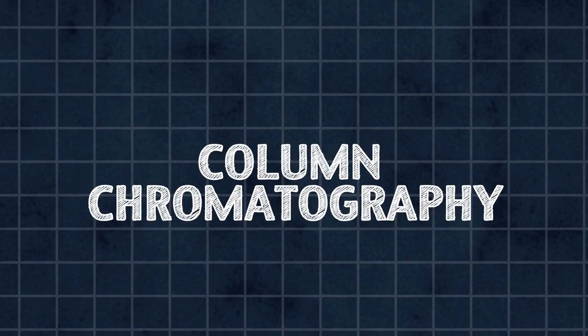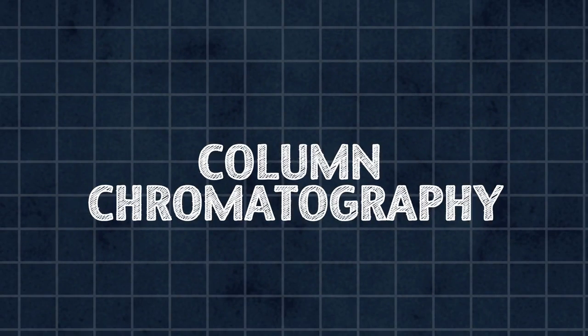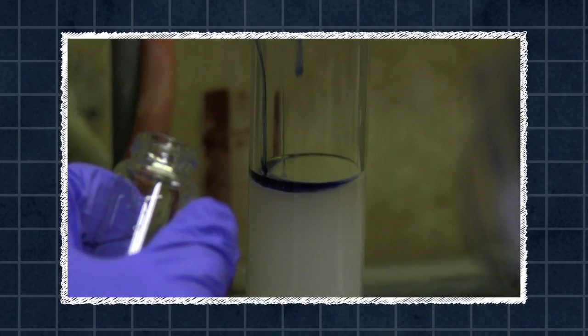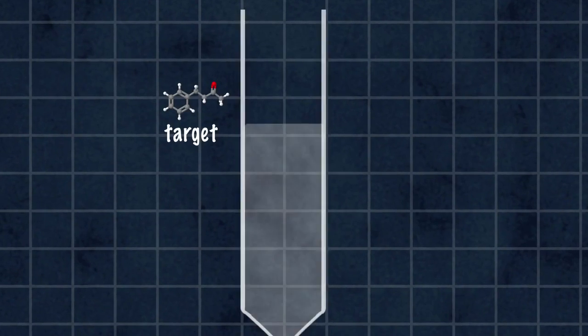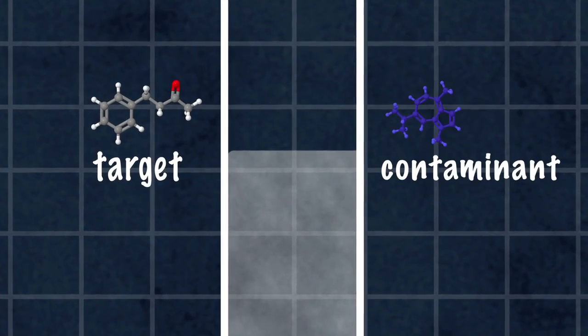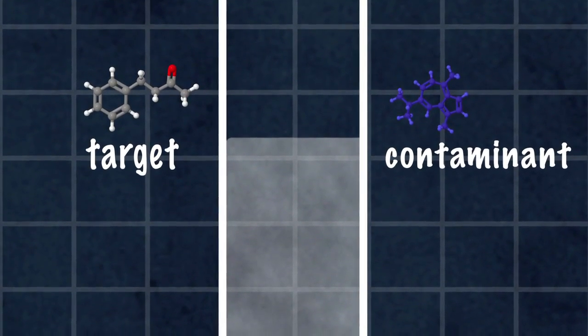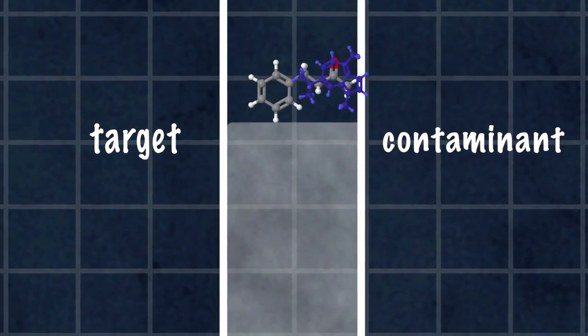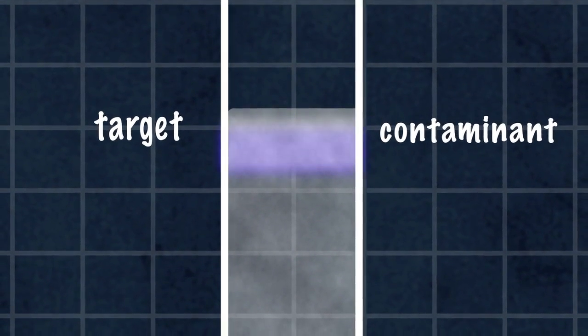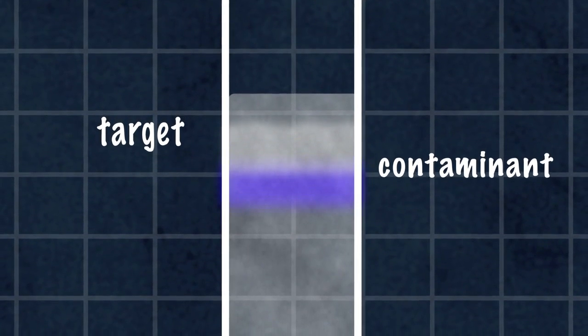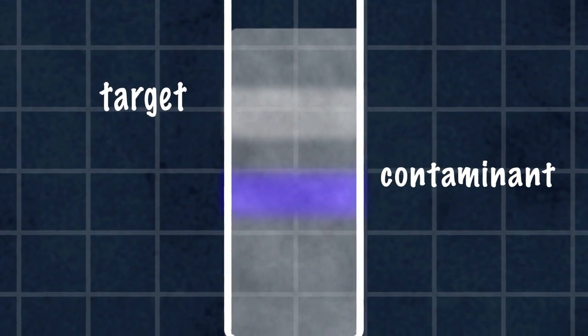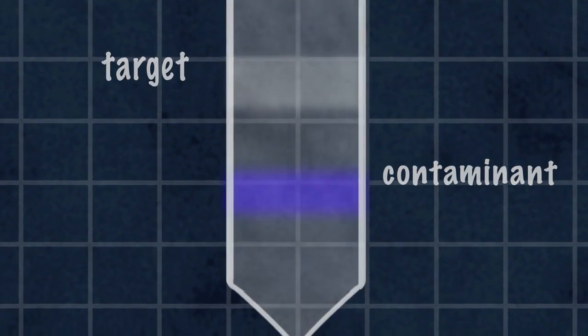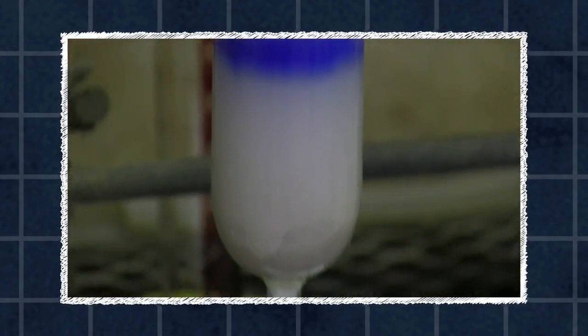Column chromatography is another way to separate mixtures. The students first pack the column with a special powder, then they load the mixture on top. The target molecule is benzalacetone, and it's contaminated with guaiazulene, a dark blue impurity. As the mixture is washed down the column, the target sticks to the solid powder more strongly than the contaminant. So the mixture separates into two narrow bands, which come out of the column at different times.